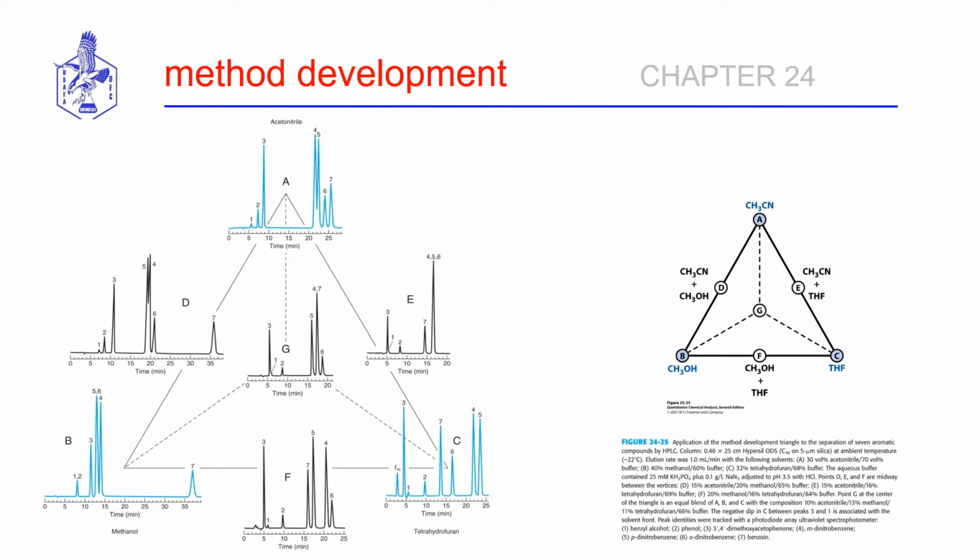It's a big part of research and development, as I described, as scientists are trying to find a cure for COVID. The analysis of complex samples involves this method development process. We have to choose the appropriate stationary phase and all of the parameters that go into that. And then we have to choose the appropriate mobile phase.